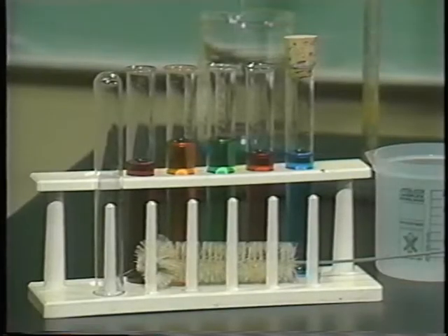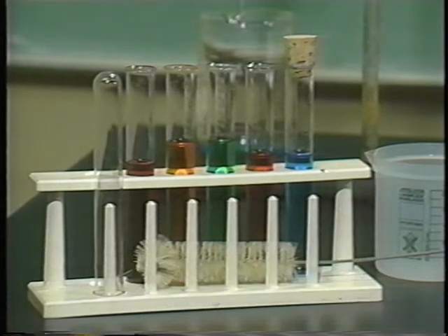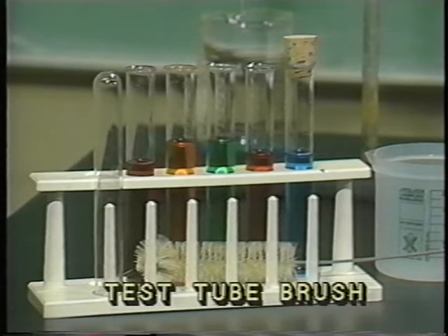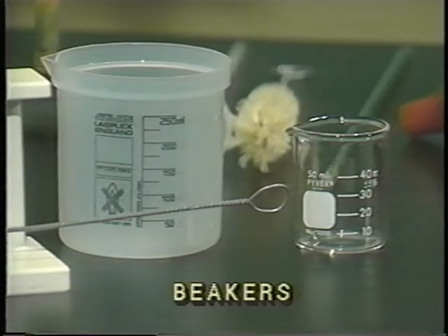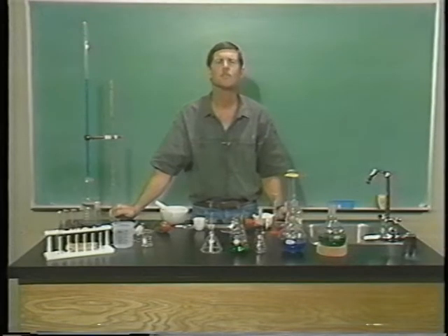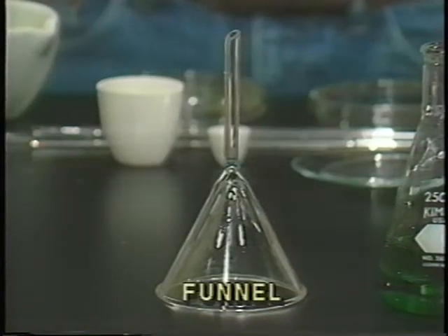Let's start by examining glassware. On my right, you see a number of test tubes. Everybody knows what they are. The one that's upside down is drying, and there's a test tube brush at the bottom used for cleaning them. Next to the test tube rack, we have two different types of beakers. One is plastic, and the other is glass. Beakers come in all sizes. Over here we have a funnel. Of course, everybody knows what that is.